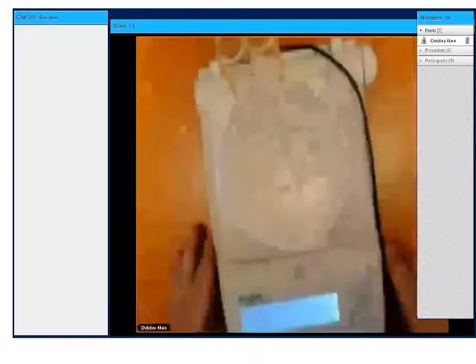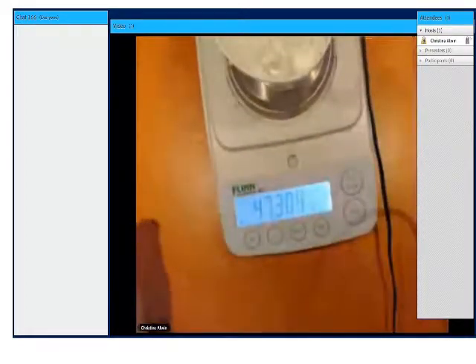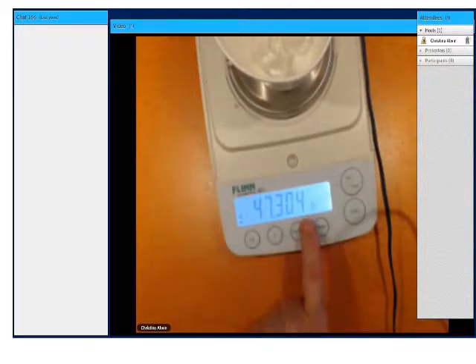So we're taking the entire mass here of the cup and the 2 test tubes. So our beginning mass in this experiment is going to be 47.3. We're going to leave off the 04 stuff because you're going to see that particularly this thousandths place will often change just depending upon how much I shake the desk. So it's going to change because that's a really sensitive number.